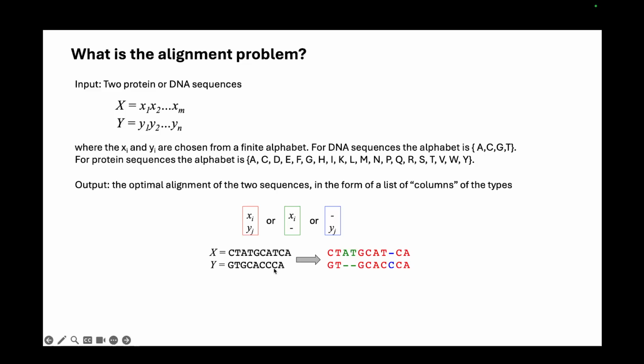Now, if you're trying to align them, alignment in a very intuitive manner is just to match these different strings together. If you just want to manually match these strings, as you see, there's one T matching here in the second position. Then you have GC here, so these two match, but this comes at the cost of two gaps here. We'll talk about gaps and how we can handle them, but just to give you an example intuitively, GCA match here, but with two gaps.